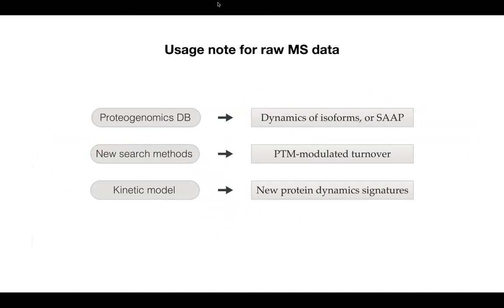So the question now is, if you're a new data user, what could you use these raw mass spectrometry data files for? We think there are a good number of potential scenarios where you could reanalyze this data set and get new information out of the mass spec files. For example, we know that in a typical database search, the majority of the MS2 spectra remain unidentified. And in our current analysis pipeline, our objective wasn't really to be as exhaustive as possible in our search, because of many things, one of which is the time constraint of doing exhaustive searches.